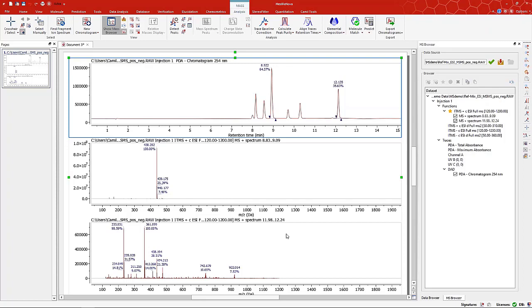And instead of looking at the positive ions, I want to now look at my negative spectrum, because you know as well as I do, when you're doing a reaction and you get a product, typically all methods scan between positive and negative because you never know which one's going to be stronger, which depends on matrix effects or the functionality, the groups in the molecule. Like a carboxylic acid shows up better in the negative. Pyridines, amines will show up in the positive, things like that. So without making any assumptions, typically mass spec instruments' methods will scan both.